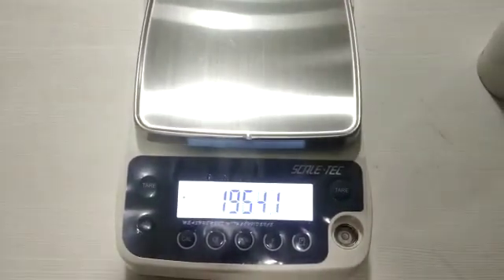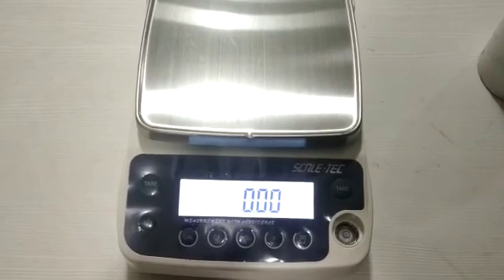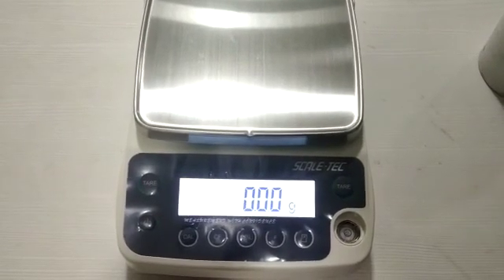So this is the result of the machine called 3202. Thank you so much everyone.